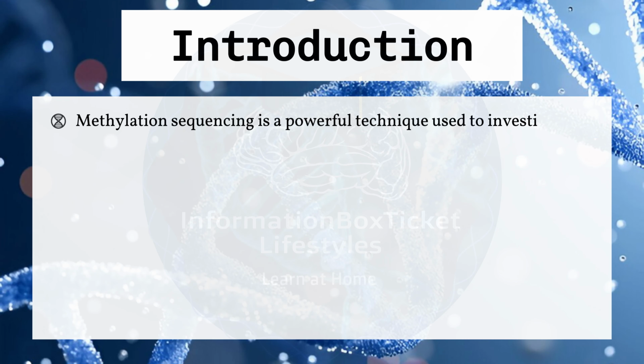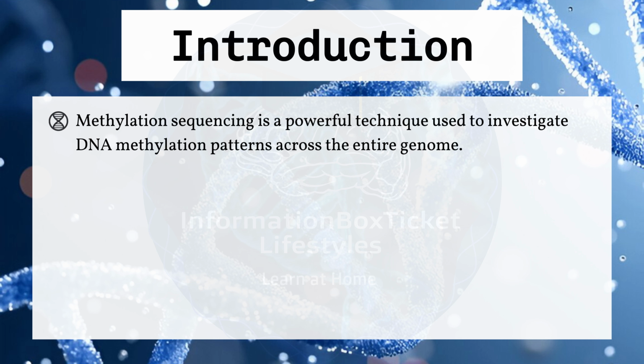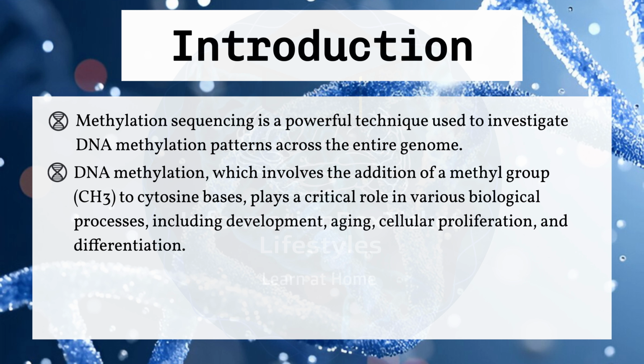Introduction. Methylation sequencing is a powerful technique used to investigate DNA methylation patterns across the entire genome. DNA methylation, which involves the addition of a methyl group, CH3, to cytosine bases, plays a critical role in various biological processes, including development, aging, cellular proliferation, and differentiation. It also contributes to the onset of various diseases.